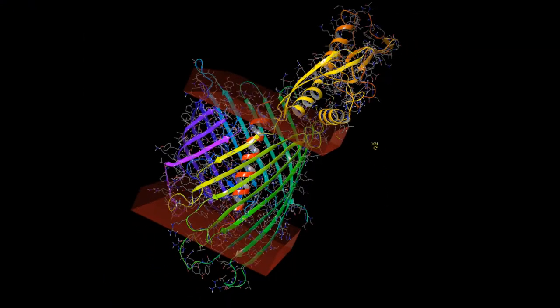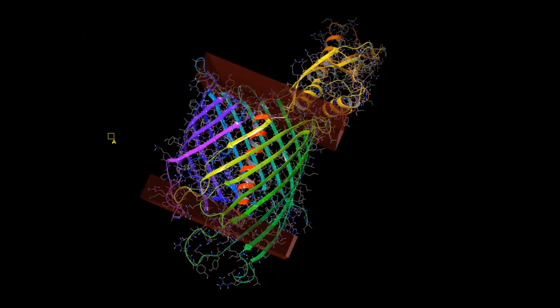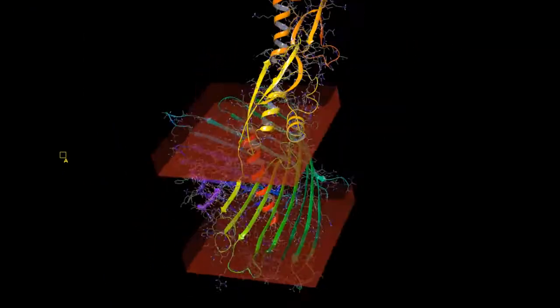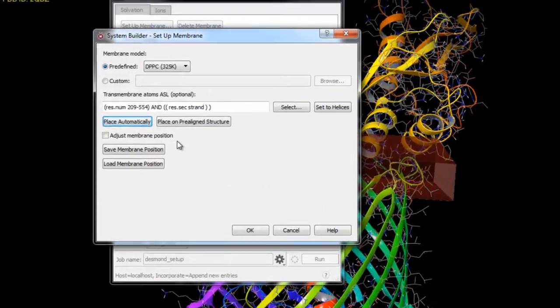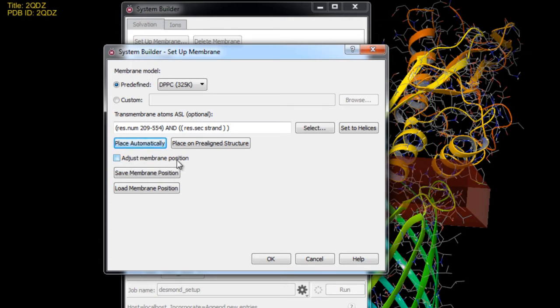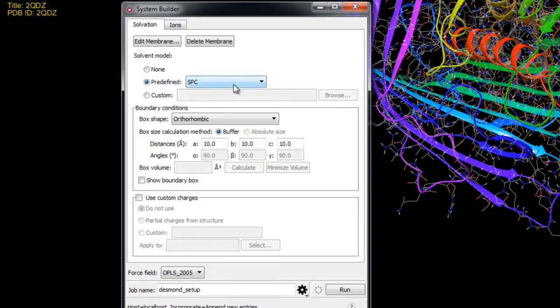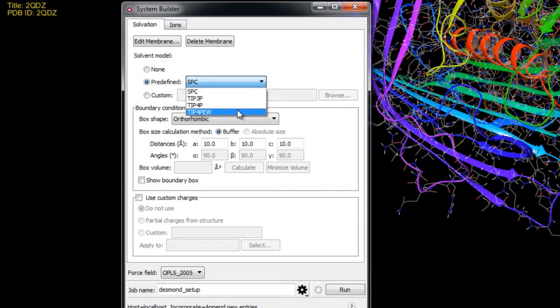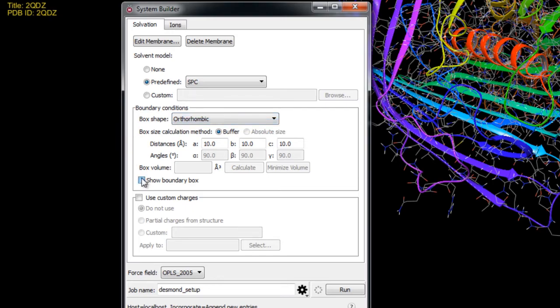Click OK then now we'll click place automatically again. Now the membrane is placed again this time in the correct position around the beta barrel. Now if some finer adjustments are needed you could select the adjust membrane position and then use the middle mouse button to rotate and improve the membrane alignment. But that's not necessary in this example. Now here we can choose from a selection of solvent models. But we'll just keep it on the default SPC. The boundary box defaults to orthorhombic. And we can show the boundary box.